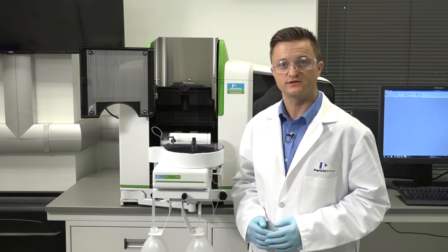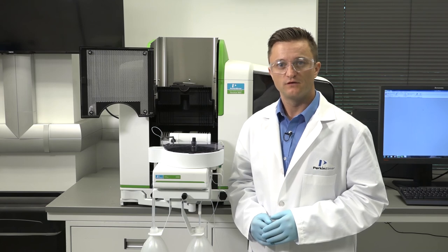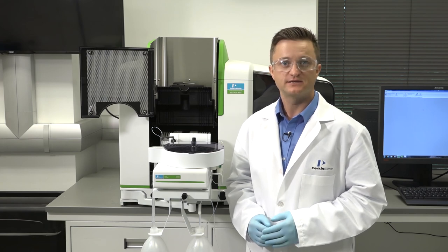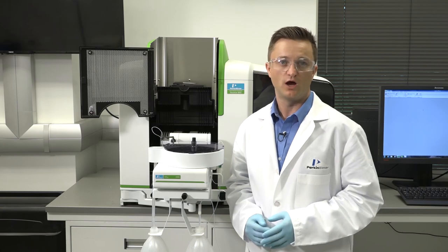Your furnace tube has now been replaced and you are ready to start your analysis. Your instrument manual and these how-to videos are great resources to help get you familiar with your AA instrument. For more in-depth information on how to properly maintain and use your Pinnacle AA system, sign up for one of our training courses or contact your PerkinElmer representative for additional options.